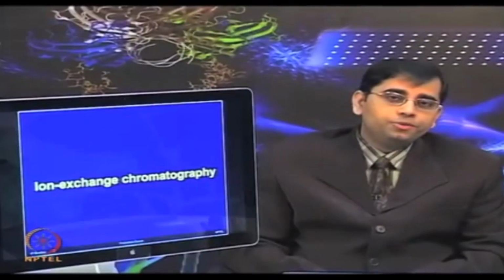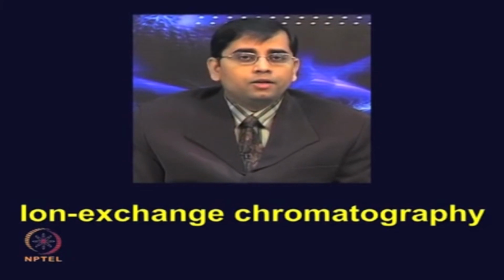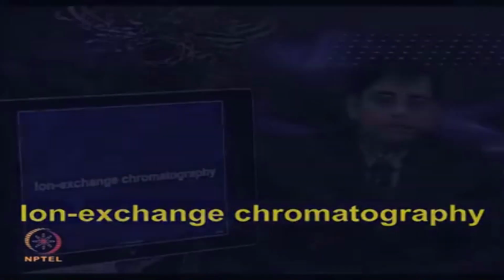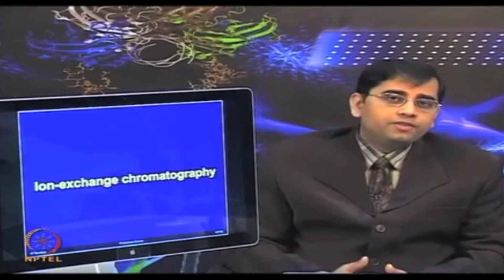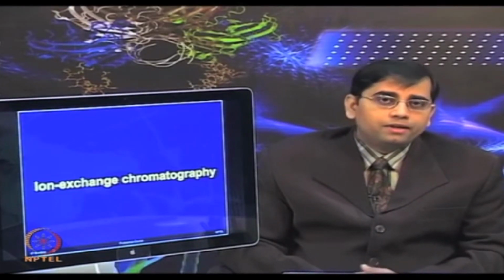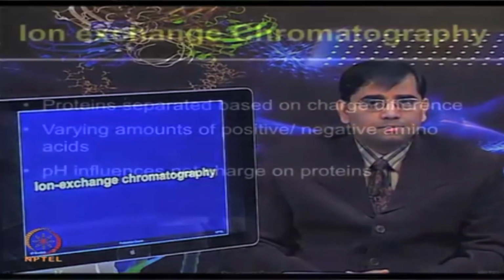Let us now move on to the next chromatography method, which is ion exchange chromatography. This is one of the most versatile chromatographic separation methods, which relies on differences between the number of charges and distribution of charge groups in defined pH and solvent conditions.